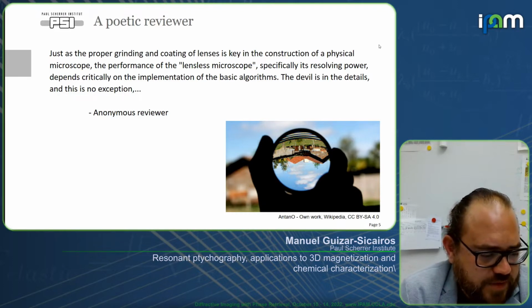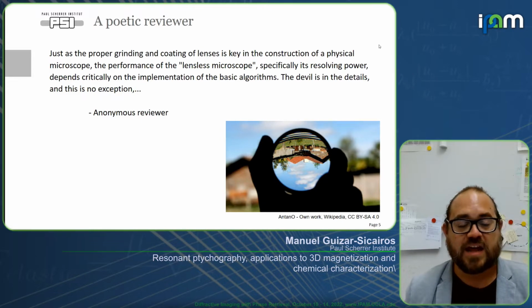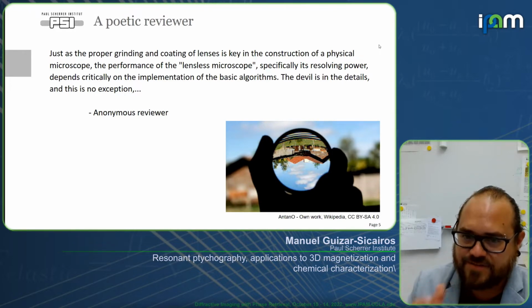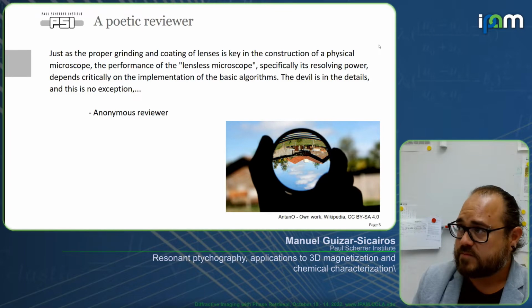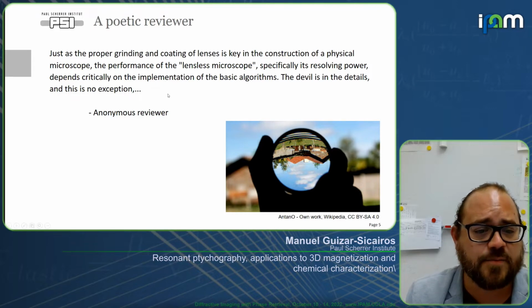And one thing that we hear often is, okay, you can use whatever phase retrieval algorithm, you will get an image anyway. And that is very true, especially in the case of ptychography, that is very robust. But at the same time, we have seen that the choice of the recipe or the right algorithms to use can give a very substantial improvement on the image. So just to leave you with that.